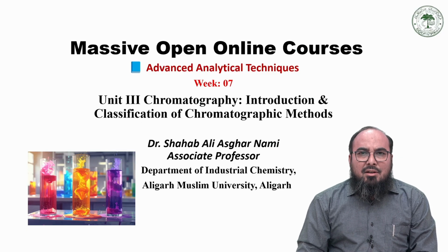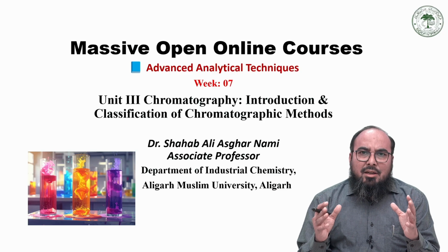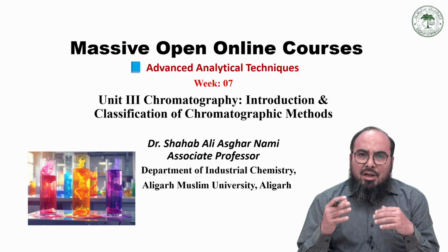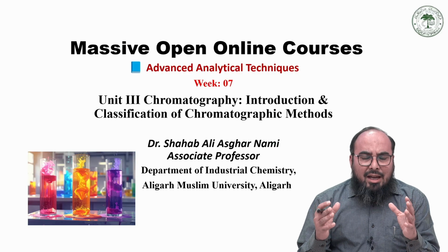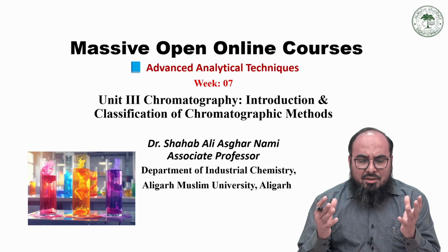So this is week 7 of our course, and in this series of lectures we will be discussing chromatography. We will be discussing important basic terms which we will use in our coming slides and lectures, and we will also study the various chromatographic separations.